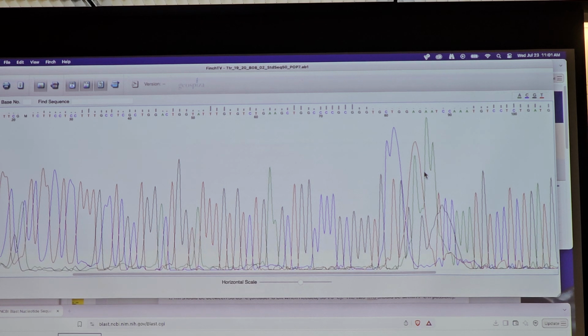So the intensities, they vary wildly. Remember that each of these bands comes from a termination at a specific nucleotide. Remember, these are terminations with dideoxynucleotides. And remember how when we were doing this on the board, say we were in the G tube, we'd get terminations at all the G's, but only in some of the molecules, and that's why synthesis could continue. So we got to the first G, some would terminate there, but most would continue, right? You get to the second G, some would terminate there, and most would continue.